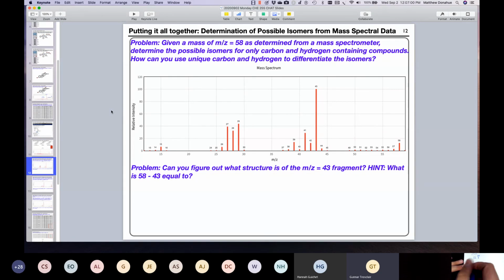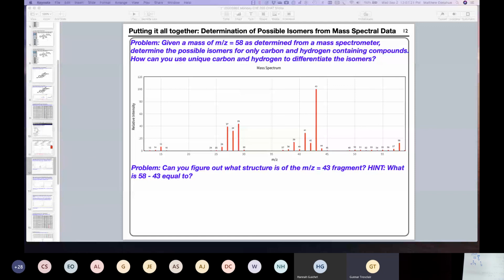Now for this one, the methyl groups are all the same. So 3, 6, 9. And then we have a methine as 1. So notice in both cases, they both equal 10. So Carly, I hope that answered your question. If not, we can schedule a meeting to go through that.